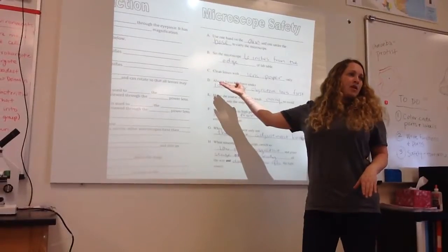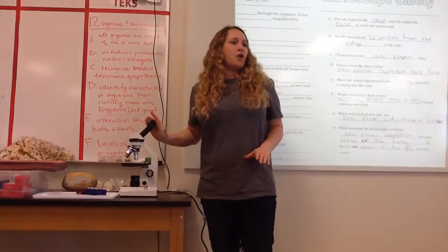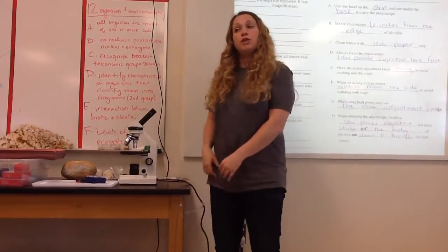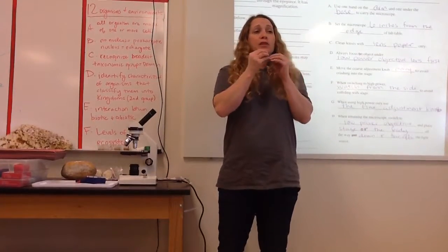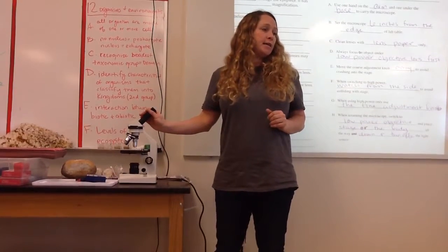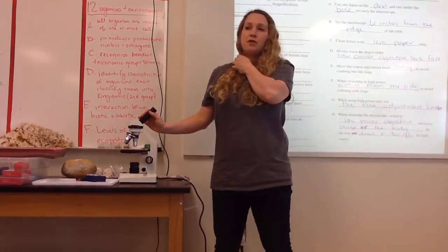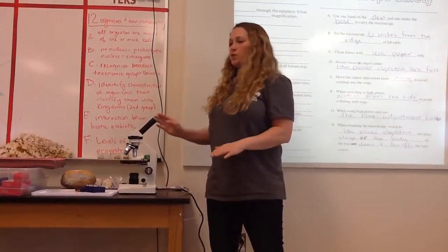Step 3, clean the lens with lens paper only. So the glass on the microscope is very important. It's delicate, it's a fine glass so that you can see really well. If you use your t-shirt or your finger or your backpack or some piece of cloth, there's going to be little pieces of grit in it. Then when you rub them on there, guess what will happen to your delicate glass? It'll get scratched up. Then you go to look in your microscope and guess what you're going to magnify? Scratches. Hundreds of scratches. And that'll interfere with your picture and you won't be able to see the details on the slide because what you'll see is scratches.